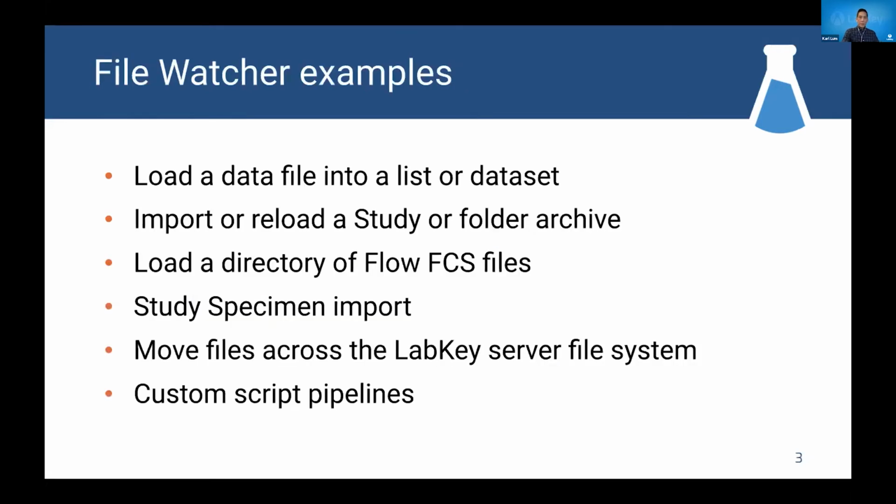So a couple examples of existing file watchers that we have in the system. You can load data into either lists or datasets. For datasets, it can be used to create a new dataset or import into an existing dataset. For lists, the list has to exist for you to load data into it. Additionally, we have file watchers to import data using a study or a folder archive. And these are the folder archives, those are the zip formats that are available for exporting either folders or studies.